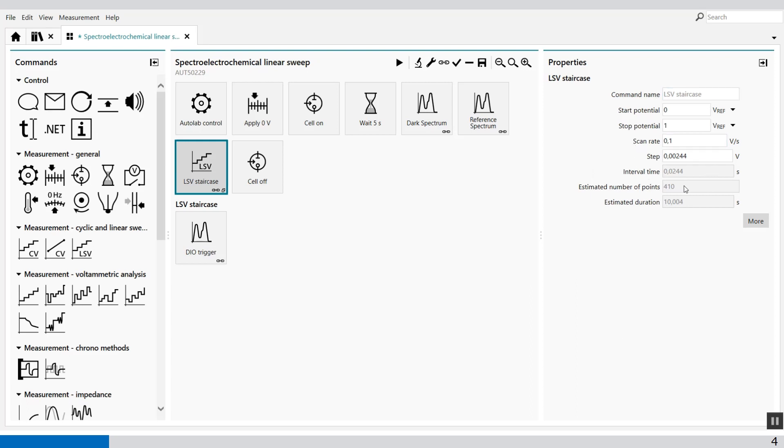This measurement has about 410 data points. And this is important because we need to know the amount of data points we're going to expect.